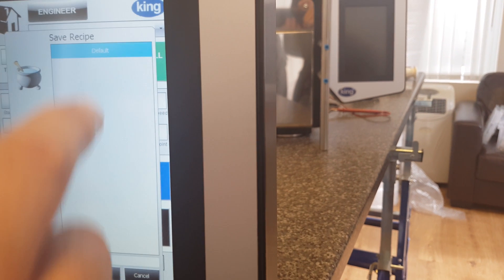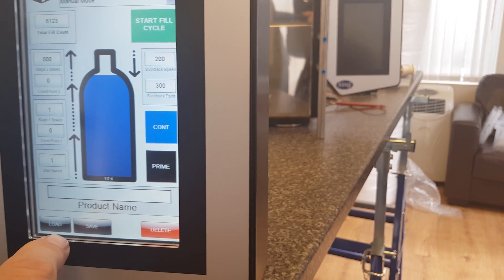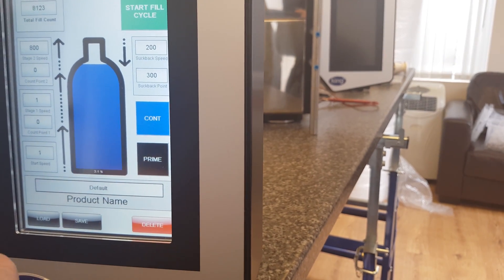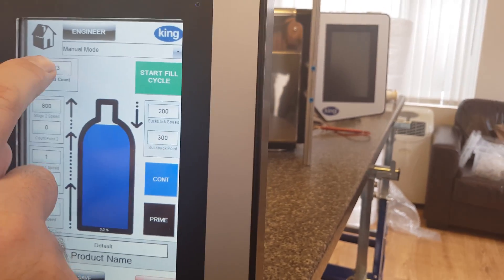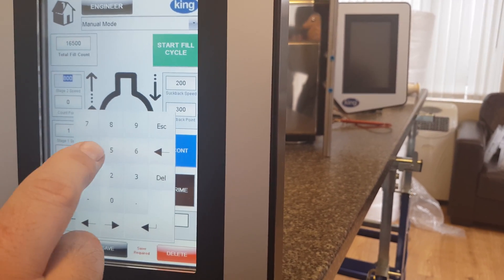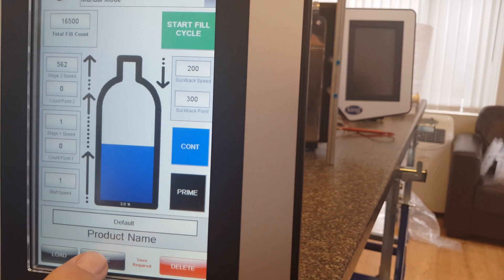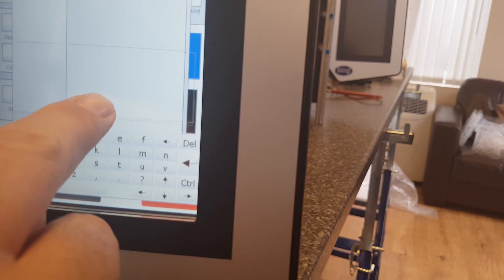So if we save that as default — save — that's correct. It saves the name 'default'. Then we load 'default' and load. So if we wanted to change product and change to a different account, and after some testing we worked out how it best fills and at what speed, we would save the product and might call it a different name. There's a little square here that allows you to move the screen, because sometimes the buttons are underneath.